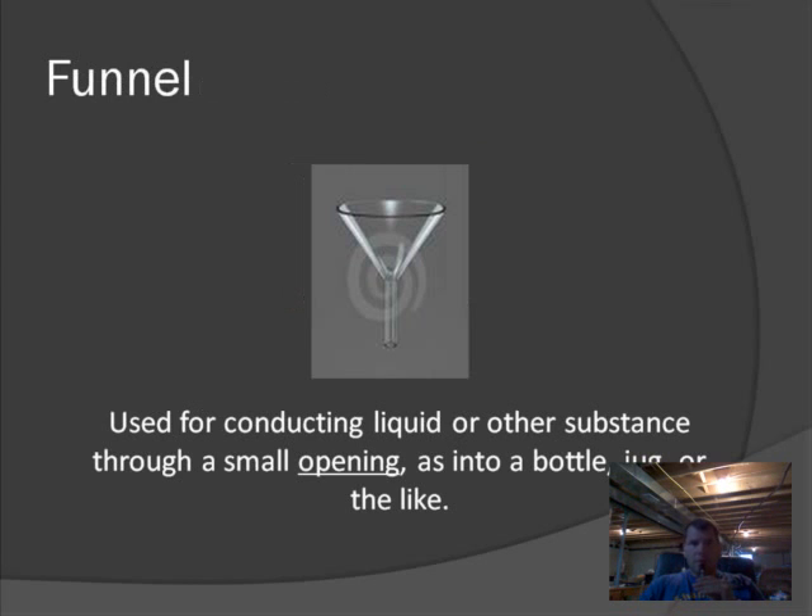The last thing is the funnel. This is used to transfer liquid, especially into a container with a small opening. We use a funnel to make sure the liquid doesn't spill. For example, the mouth of a test tube is not very big, and pouring from a bottle into a test tube is a small target to hit. So we use a funnel to make a bigger target and get liquid down into the test tube or any other container that has a small mouth.